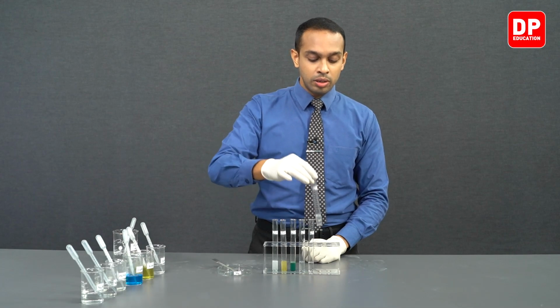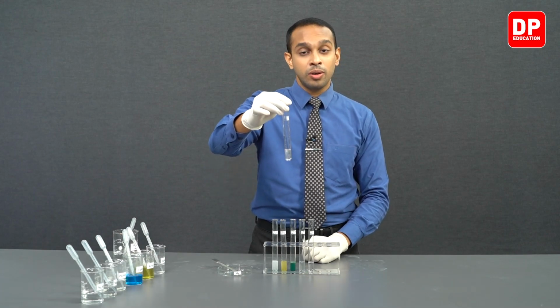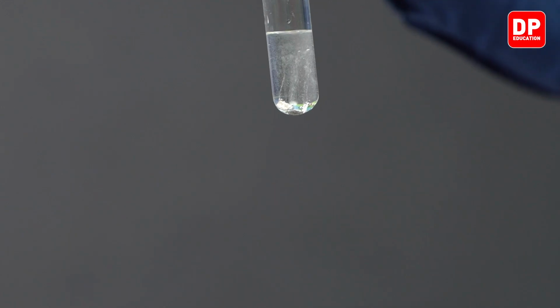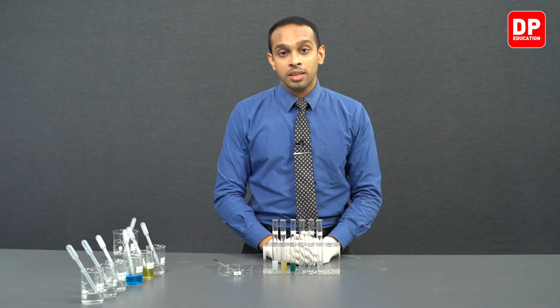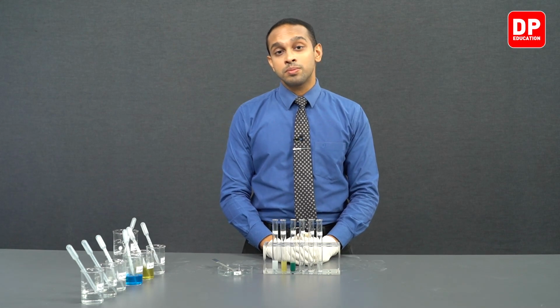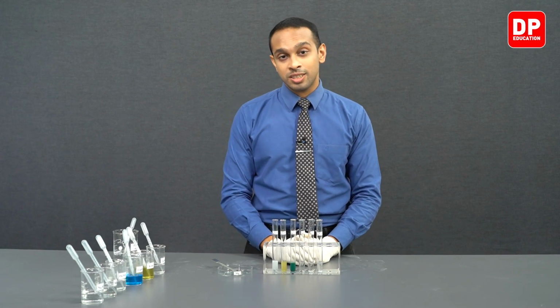But in all the other test tubes also, whether we have a reaction or not cannot be determined just by the bubbling that you observe in the test tube. A gas being produced when we add a magnesium piece into water just indicates that magnesium is reacting with water to form hydrogen gas and magnesium hydroxide.